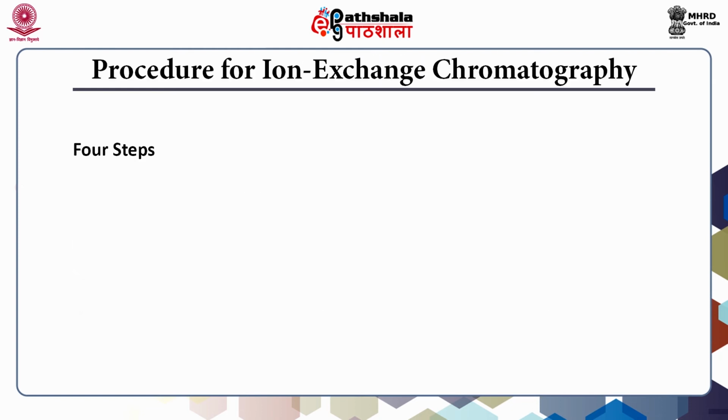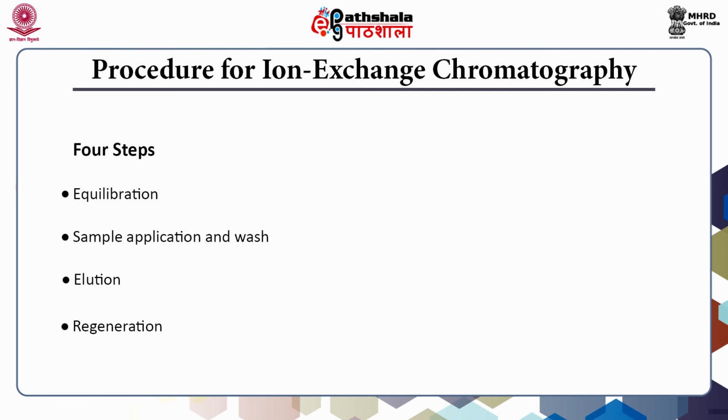There are majorly 4 steps for ion exchange chromatography when we perform the experiment. The first is equilibration, the next step is sample application and wash, the third step is elution, and the final step is regeneration. Let us discuss these steps one by one in the coming slides.